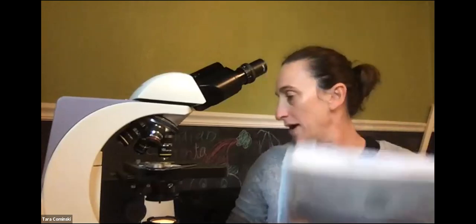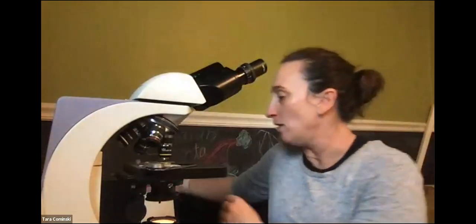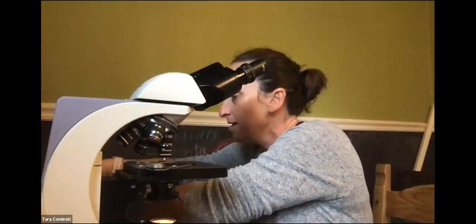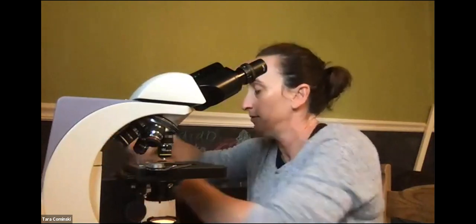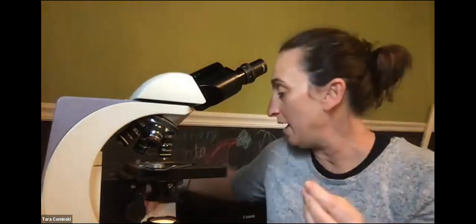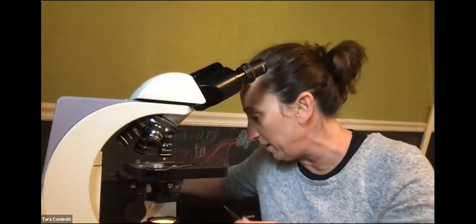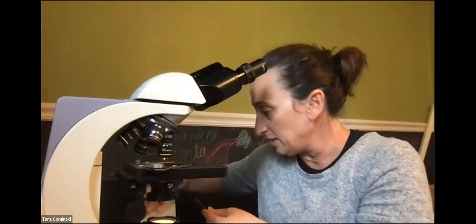I'm going to make a slide and show you how I make it, and then we'll look at it quickly to see what it looks like. If you want to make a wet mount or make a slide of anything, you just take a blank slide. I have a piece of stinky onion that I'm going to put on my slide.